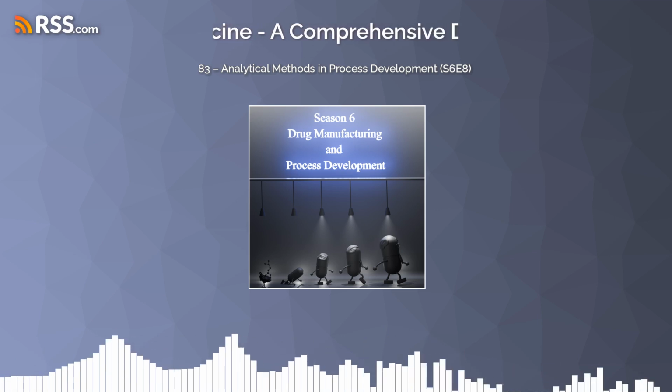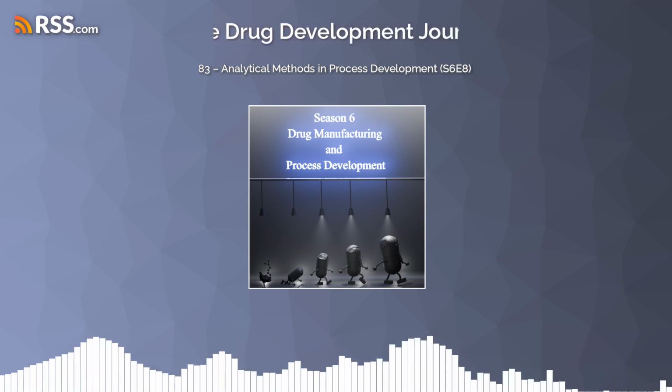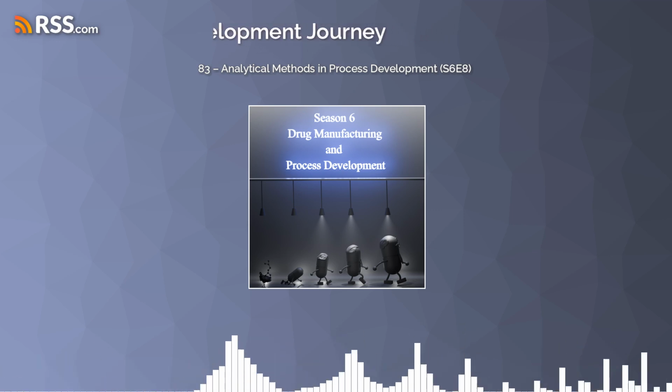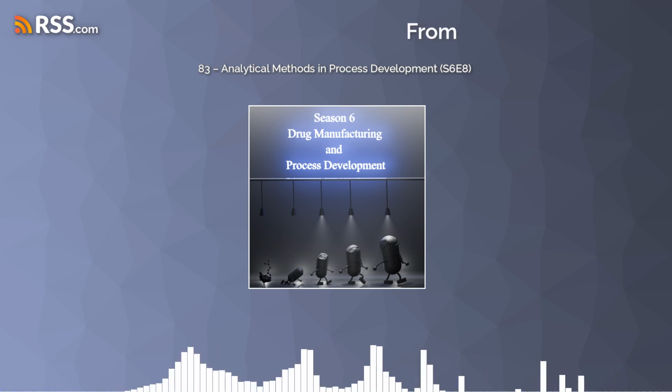Liquid chromatography, mass spectrometry. Yes, LCMS. It sounds like it combines a couple techniques. It does. It cleverly combines the separation power of HPLC with the identification capabilities of mass spec.